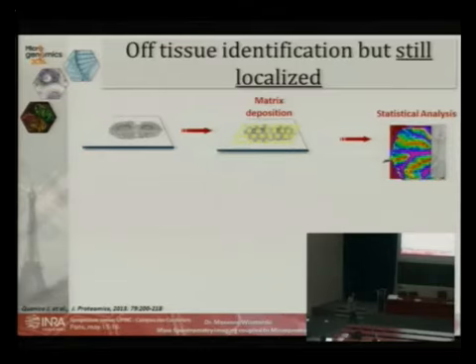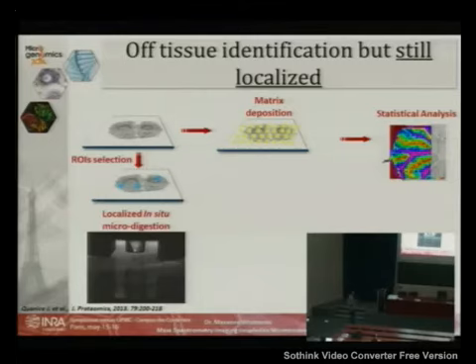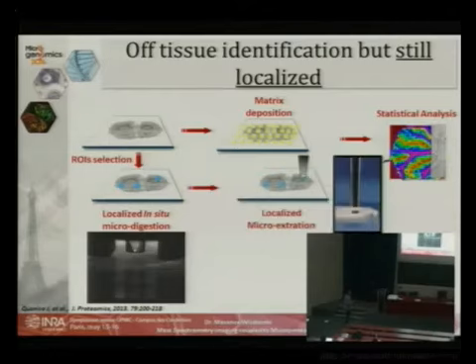Like before, we first realize mass spectrometry imaging, but this time to perform a molecular histology analysis of our tissue and to obtain regions of interest, chosen only by the molecular content. On this particular region, we perform in situ microdigestion of a small region, and we then extract the peptides obtained by a liquid microjunction, a liquid microextraction.